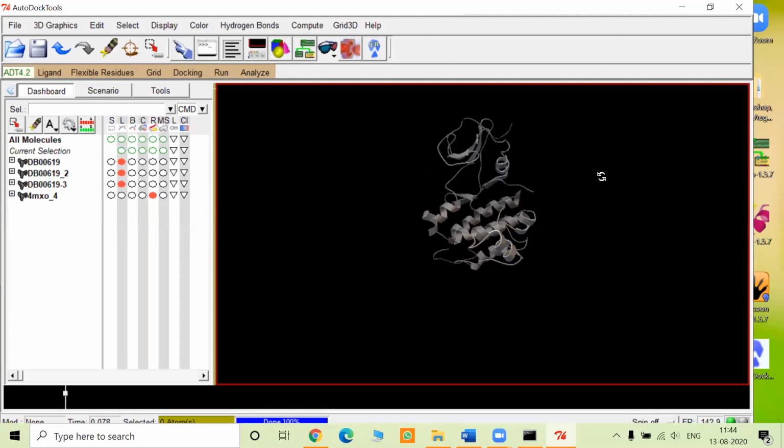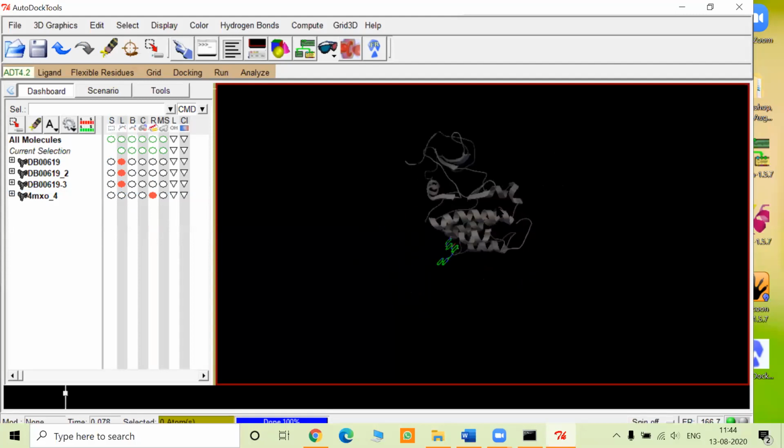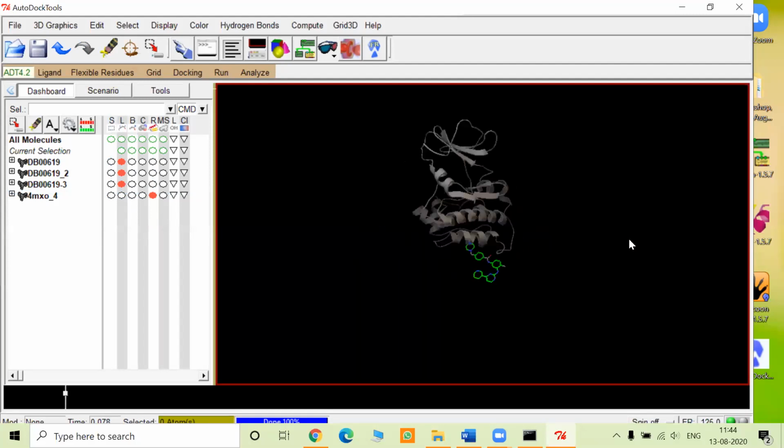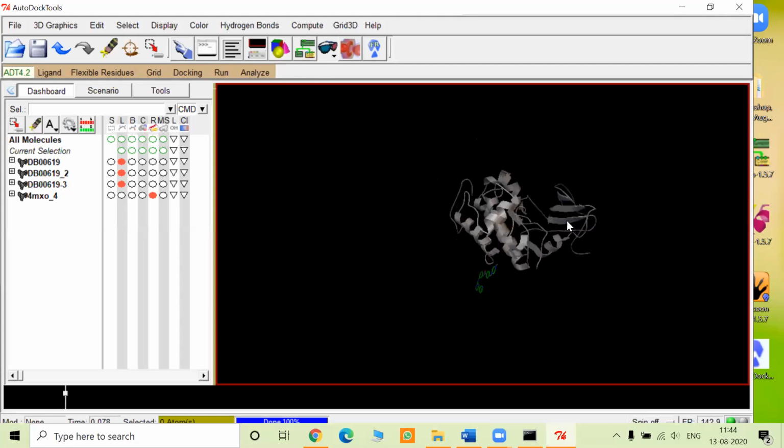Okay, no worries. There will be some hitches. We have to just learn how to understand them. Earlier it was there, but now you see, when I saved it, it was saved with only the A chain. Okay, so now this is over.